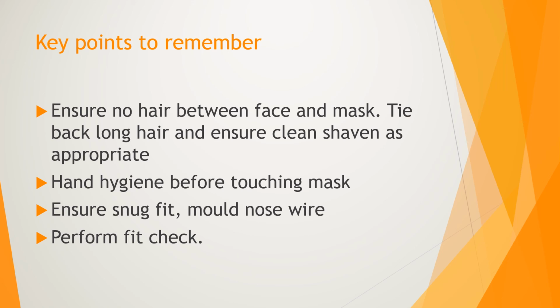And every time you put on a mask, you need to fit check it. That is where you inhale sharply and look for the collapse of the mask, and exhale sharply with your hands placed around the edge of the mask, feeling for air leaks as you exhale. If you do feel any air leaks, try adjusting the mask and remolding the nose piece once more.